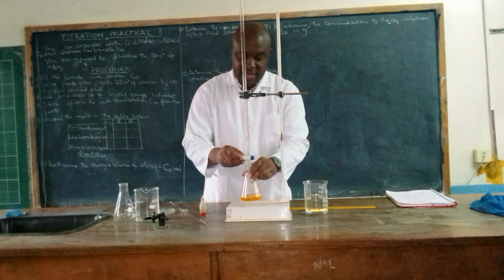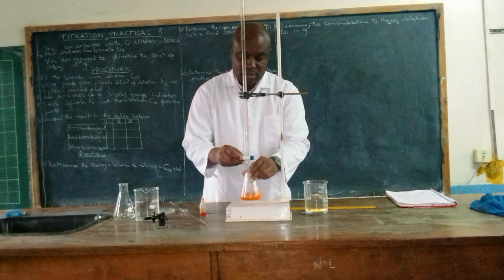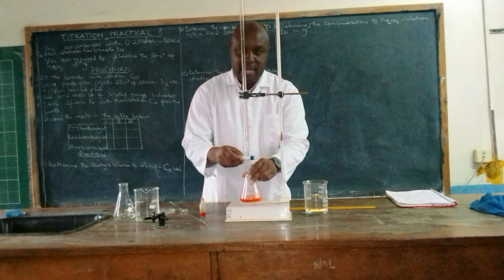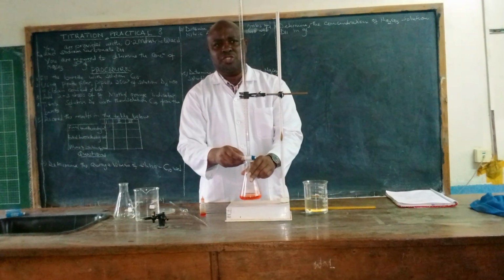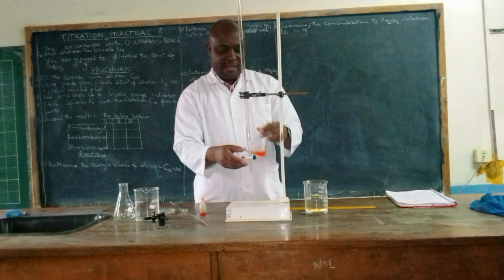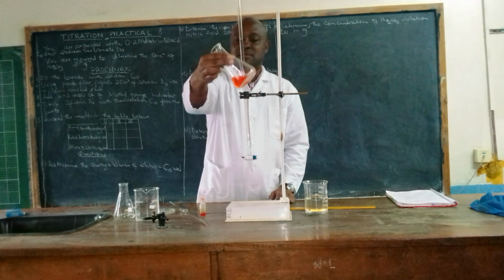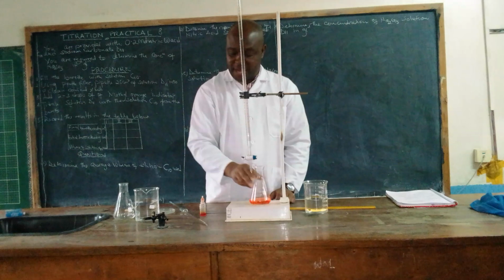Our expected color change is supposed to be pink. Now, wow, the color has changed. You can see the color has changed into pink. Very nice color.